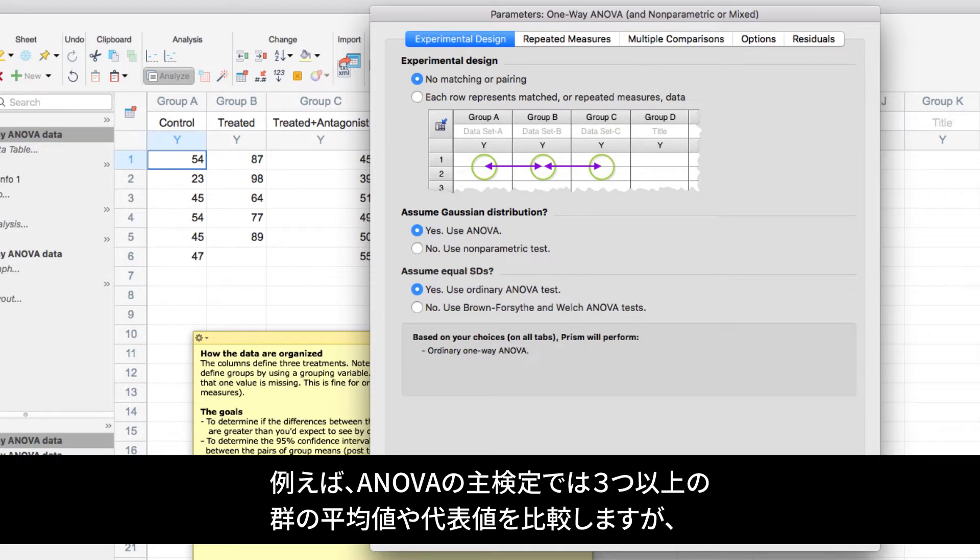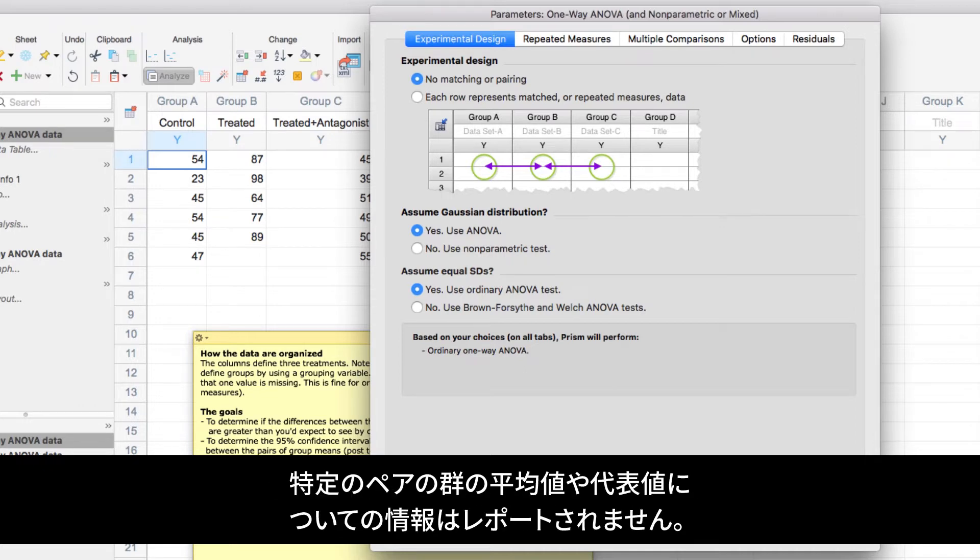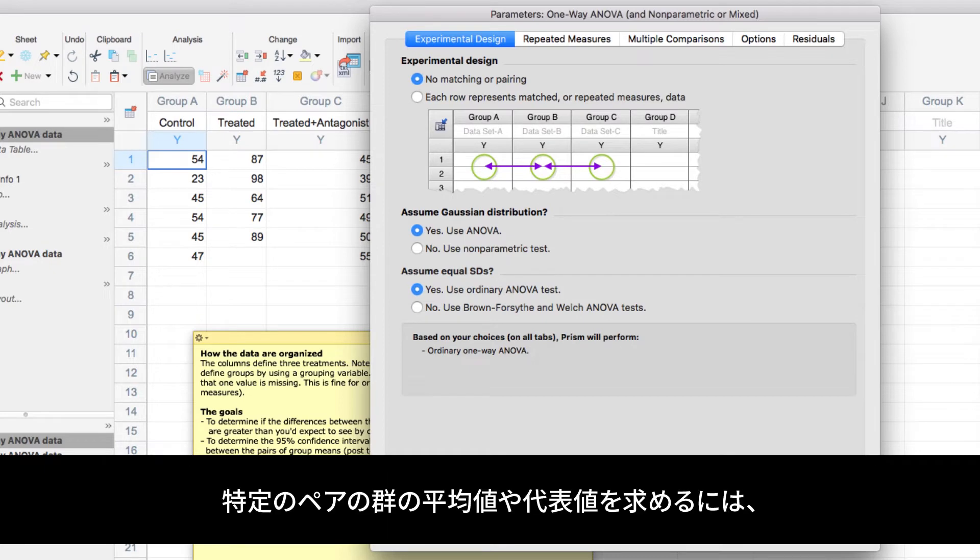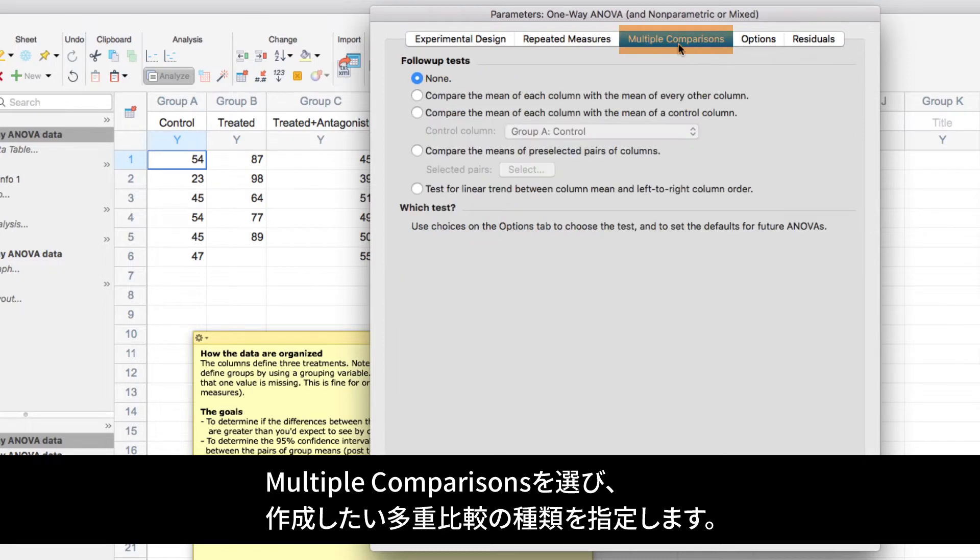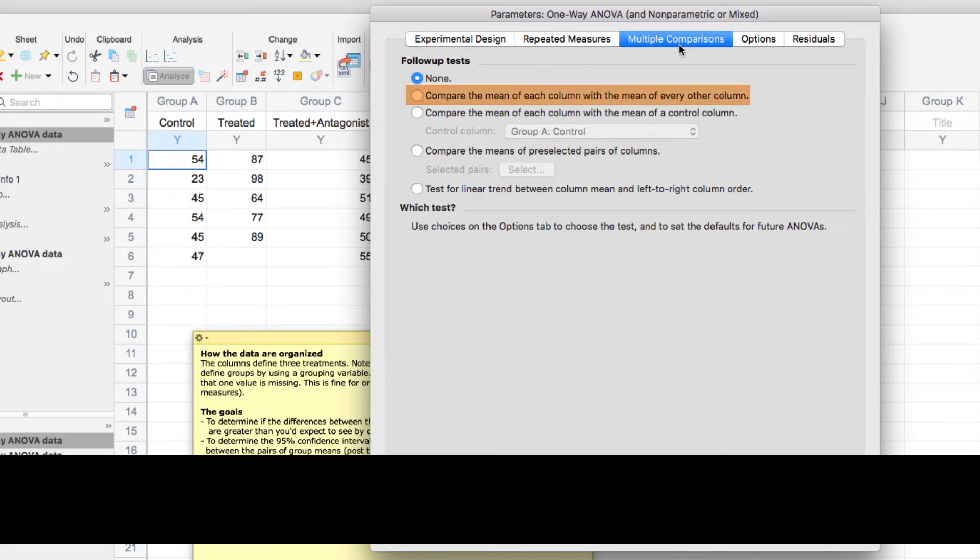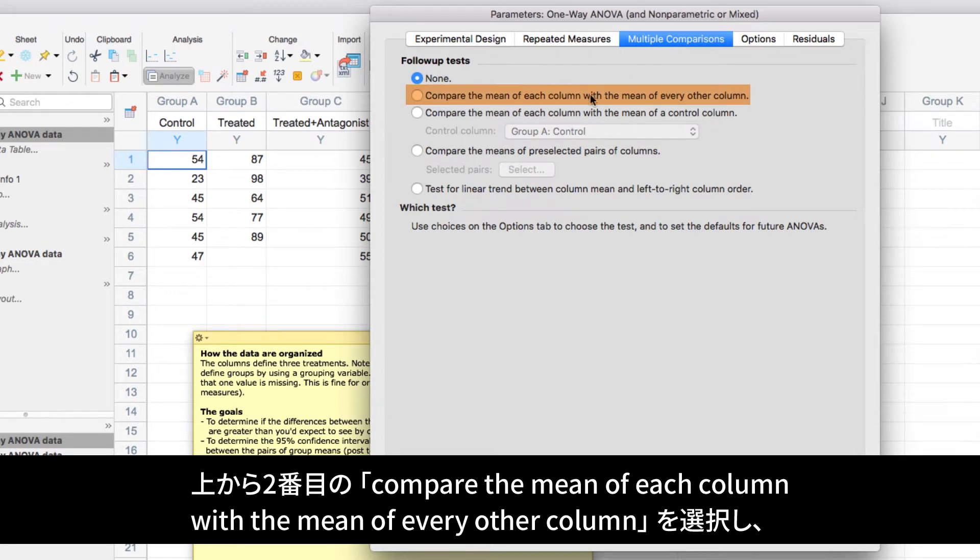Other options for the analysis can be found in the various tabs of the Parameters dialog. For example, the main test of an ANOVA looks at three or more groups and compares their means or averages. However, the main test doesn't report any information on the means or averages of any given pair of groups. To do that, we need to select multiple comparisons and define the type of multiple comparisons we'd like to make. We'll select Compare the mean of each column with the mean of every other column, and click OK.